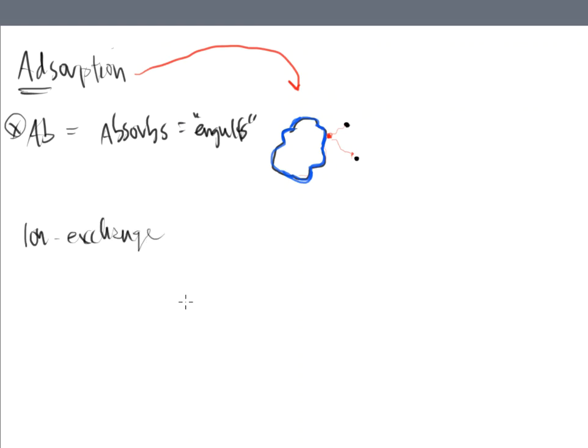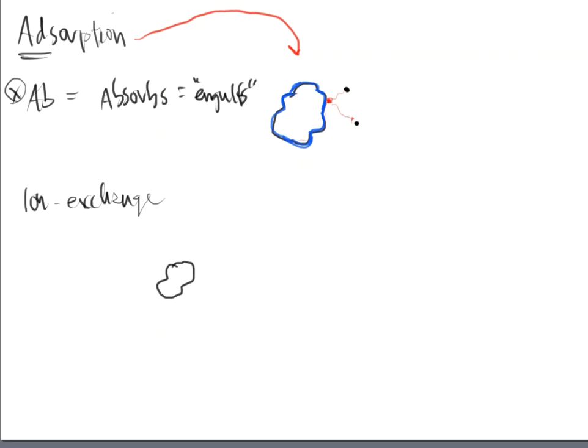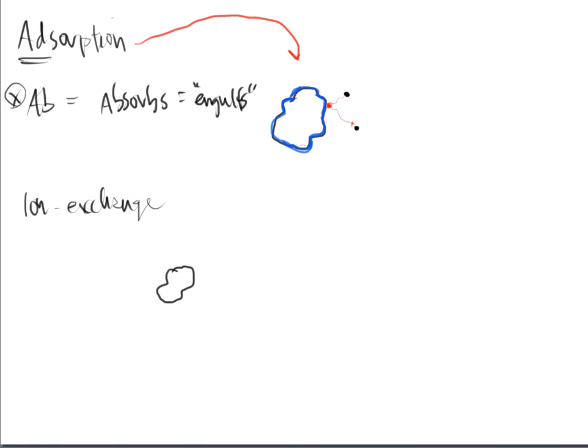what we see is a stationary phase particle, and I'm just going to write it as a blob again. And that stationary phase particle on its surface has various groups. And these groups can either be positively charged or these groups can be negatively charged, right? That's really up to the analyst to decide, and that's really what you're trying to analyze. That's why you've got two different choices. It's either going to be positive or it's going to be negative. It's like a magnet, right?